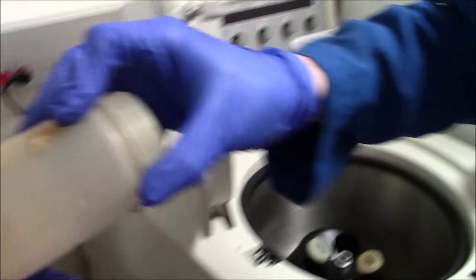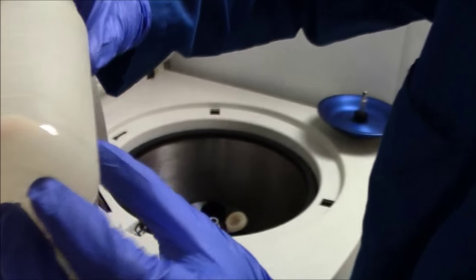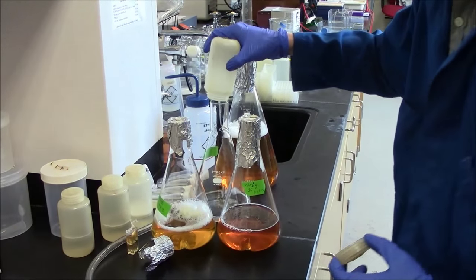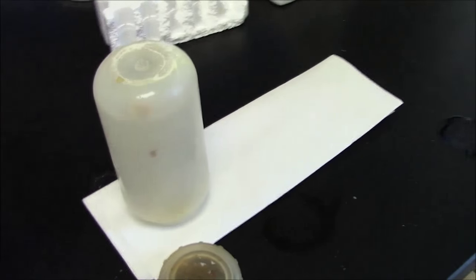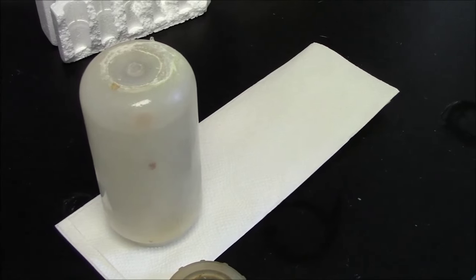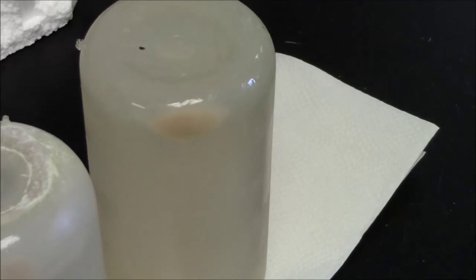There's the phage pellet. The liquid is drained by gravity to the other side of the bottle. And there's a nice phage pellet there. That's a good phage pellet. Here Josh is draining those last couple milliliters of supernatant away from the phage pellet and setting the bottle upside down on a paper towel so it can essentially drip dry. This pellet is much better than the pellet in the first bottle, so the yield can vary from prep to prep.